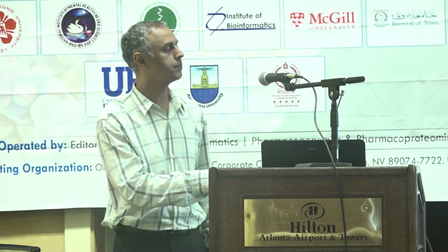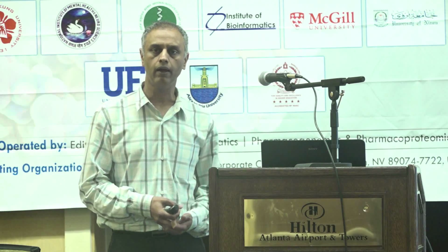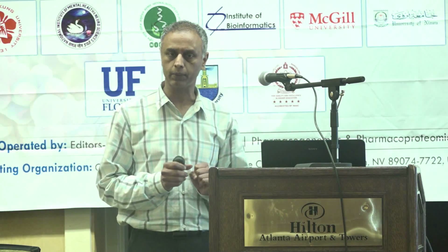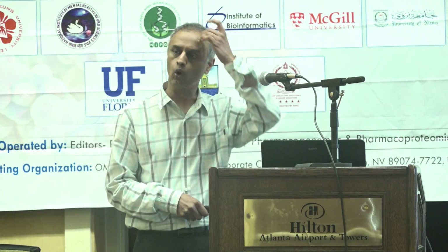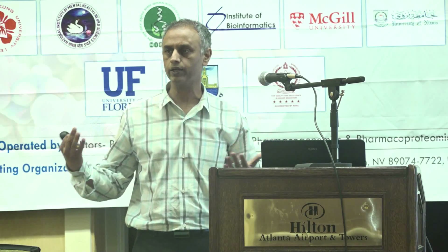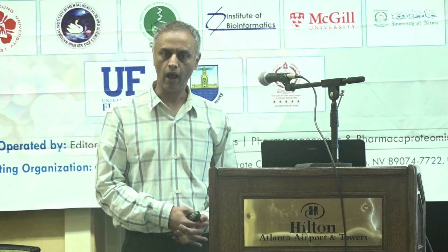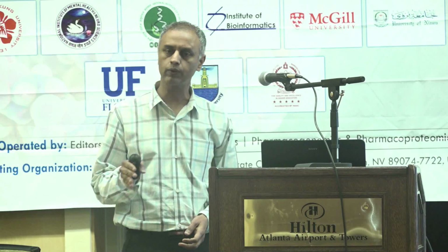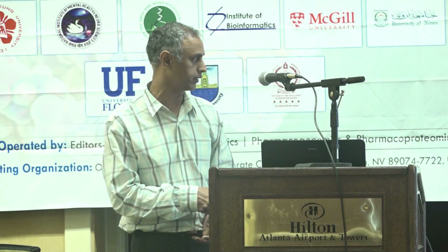And I think this is increasingly being recognized: you cannot tell antimicrobial resistance, and I will tell you how a different kind of mass spectrometry can actually do it today. And this is not universally applicable to all microbes, whereas with sequencing-based approaches, you can essentially address any microbe. And I feel the future is high-resolution mass spectrometry for microbial identification, which is based on sequencing of peptides. And in one experiment, you can actually sequence thousands of peptides.